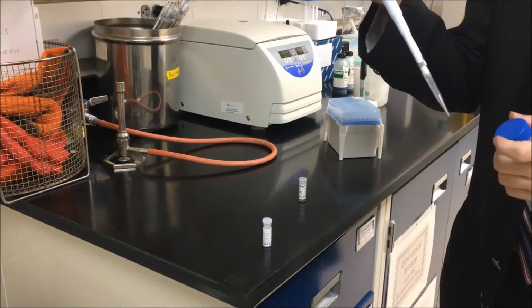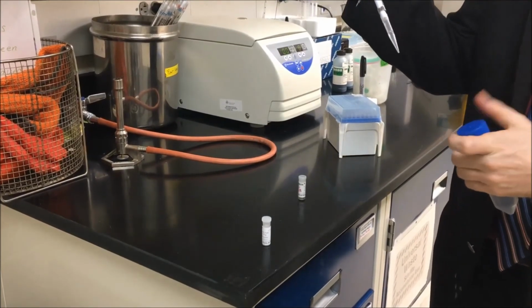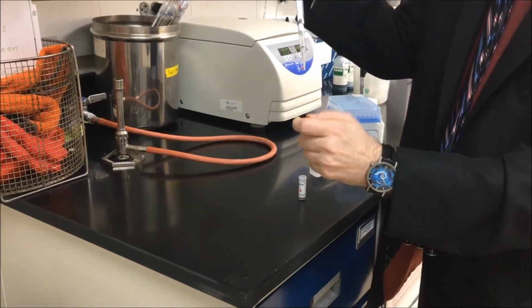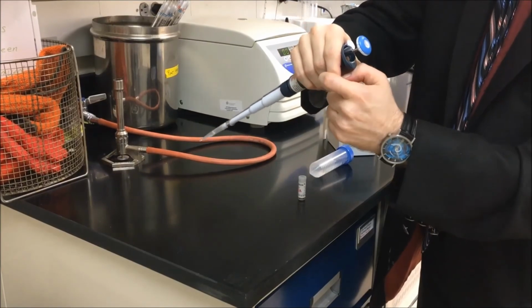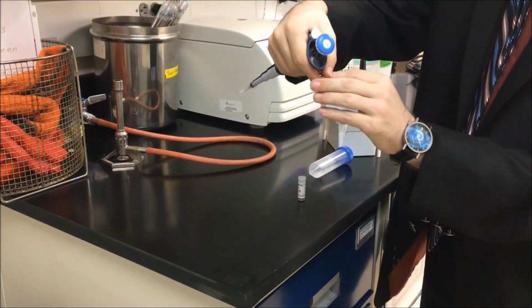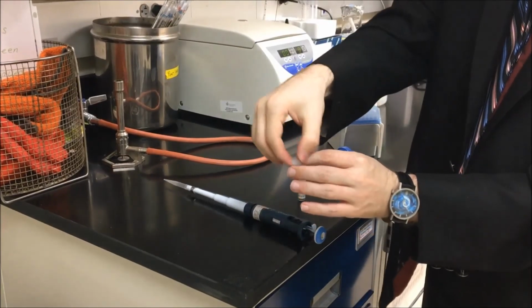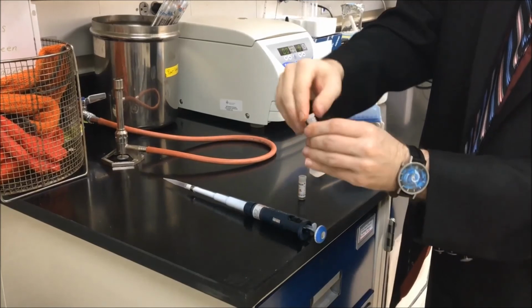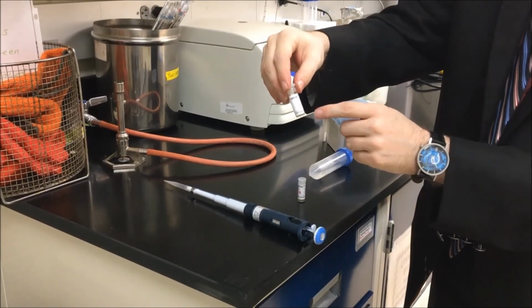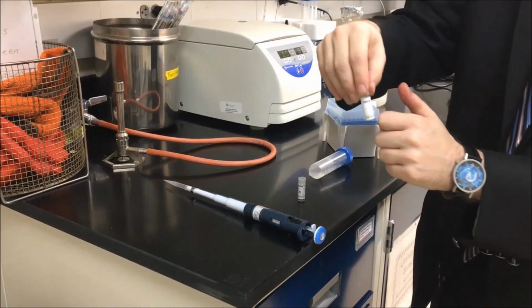So if I have a solution of ATP, I can add that solution to my tails. And then after a few moments in the dark, we will see some glowing, indicating the presence of ATP.